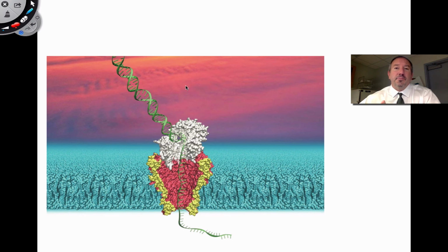It's like the future of biology, where we're basically taking a whole complete DNA that's extracted and feeding it through a pore, like you'd find in a protein channel in a plasma membrane. You can create artificial ones.